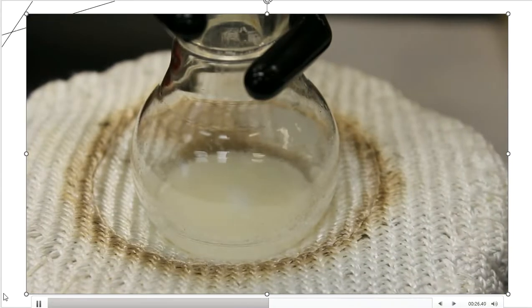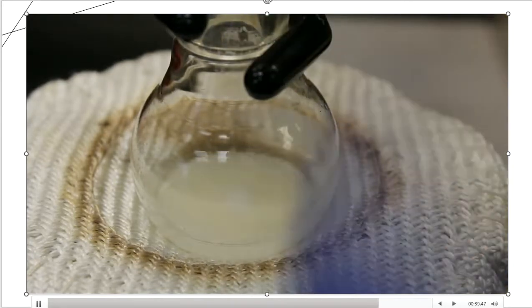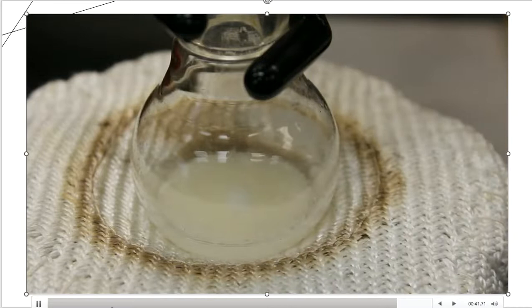Also, at the same time, I'm going to turn on the water that goes into my reflux condenser. The water is going to keep it cold, and that cold condenser, if I lose anything at all from this flask as it begins to generate some vapor, that condenser is going to push it back down into the boiling flask for me. All right, so that's the next step of the procedure, and that's what we'll do together.